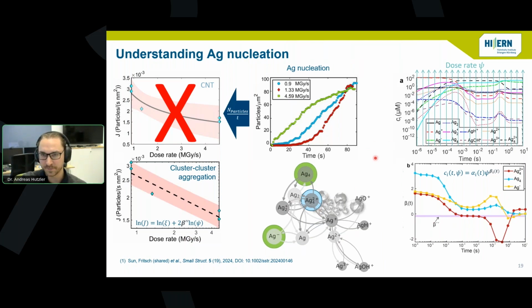So when thinking about the concentration of these species in the solution and their diffusivities, it ends up in a collision time of roughly 1 millisecond. So this seems to work, and now we can even learn something new from our radiolysis modeling.